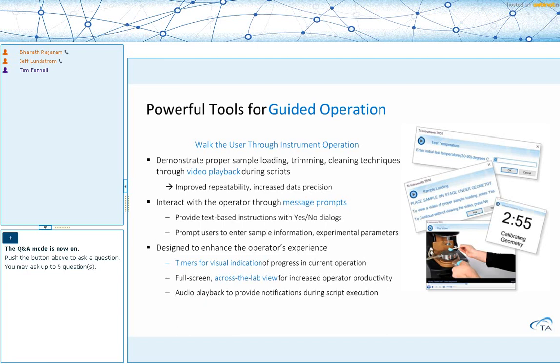You can see some changes taking place in the control panel. You then tell them to trim the sample using the appropriate tools. Sources of errors are underfilling or overfilling when loading the sample, and being able to check for that can minimize errors.